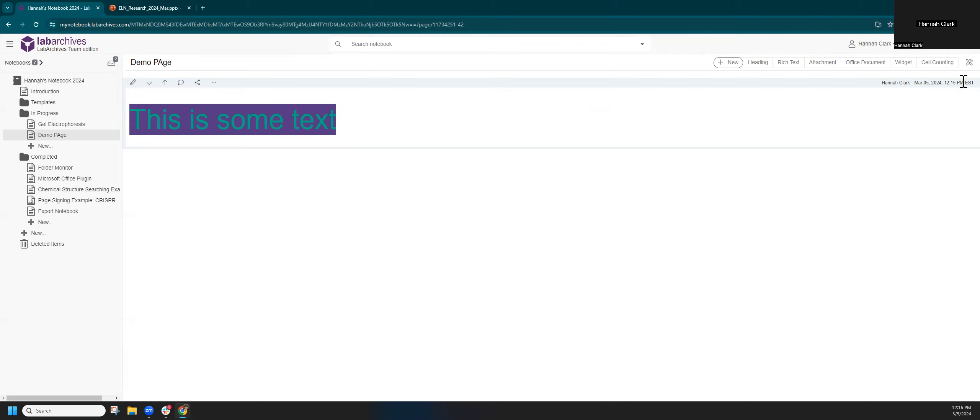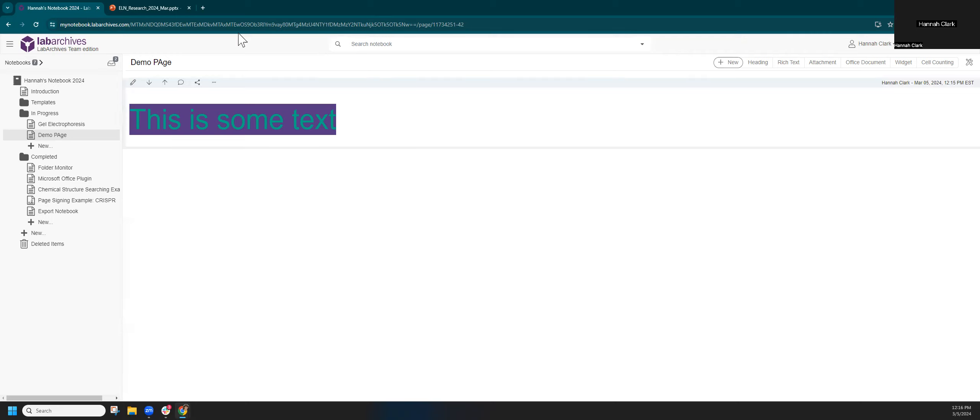There are some questions: can you edit the data in a copied page? Yes — copying gives you a whole new copy of the same entries which you can then edit. That's very common: same experiment as before but with changes. Can Microsoft OneNote notebooks be transferred to Lab Archives? Yes — OneNote has a good export format including PDF and the .one file format, and you could also copy and paste content into Lab Archives.